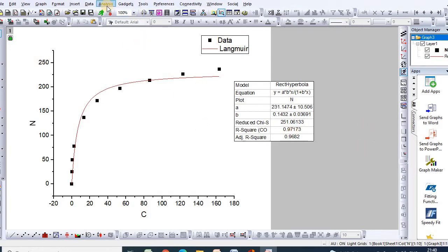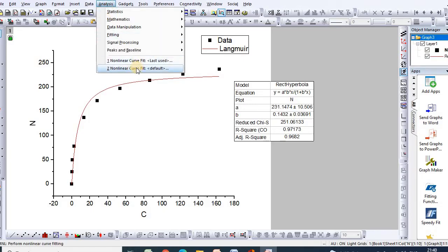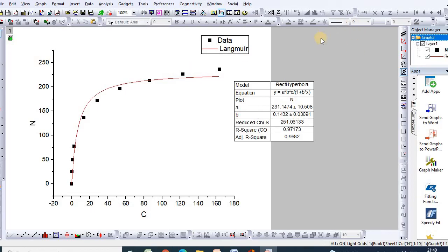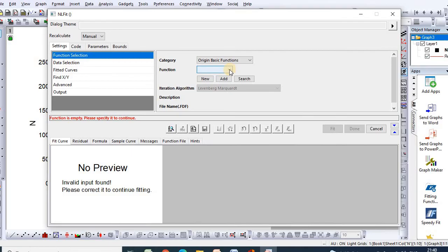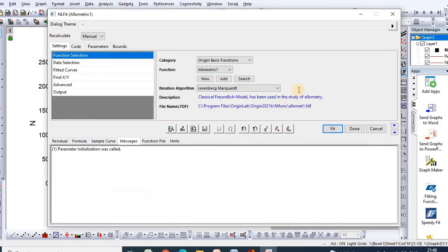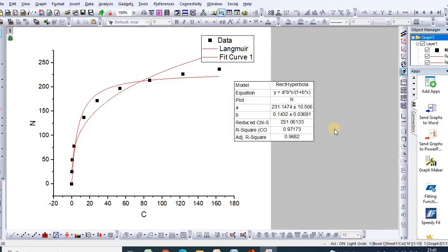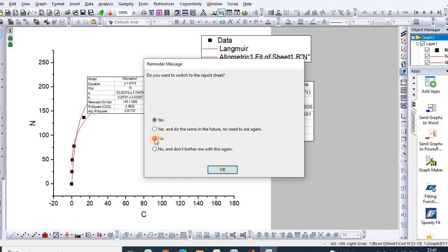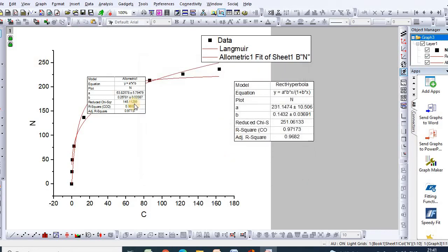Similarly, in order to fit the Freundlich equation, go to Non-linear Curve Fit Default. The function search dialog will appear — click Allometric. Then click Fit. If you click No on the prompt, it will be completed.